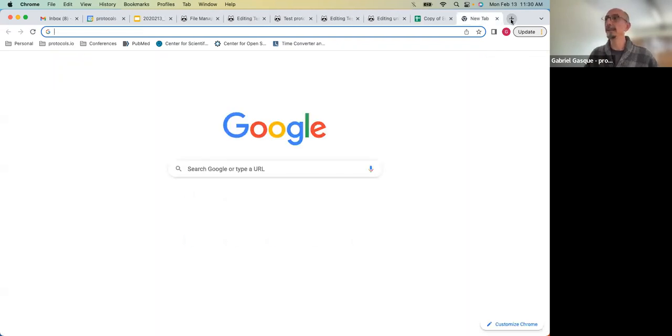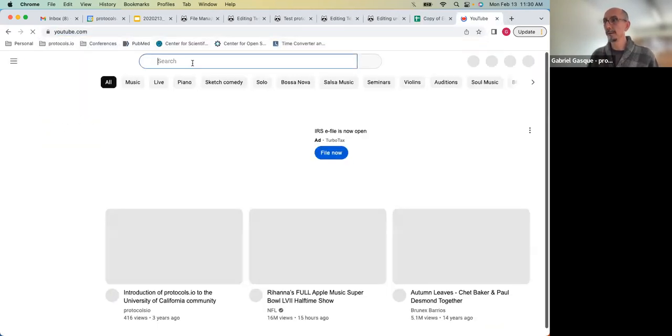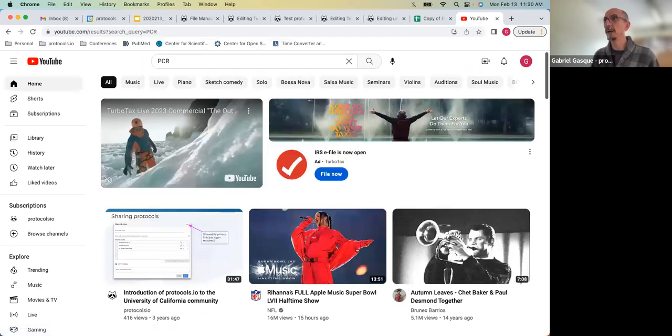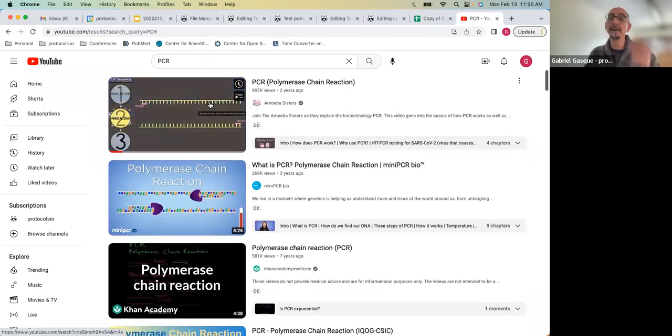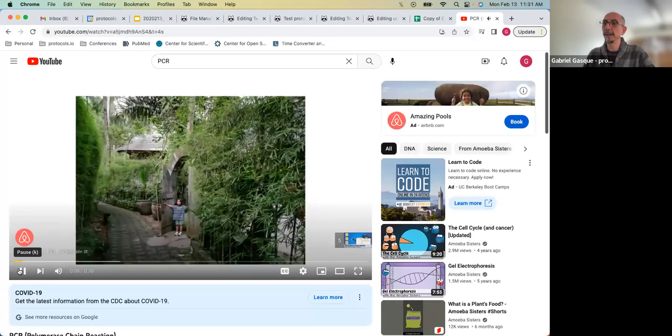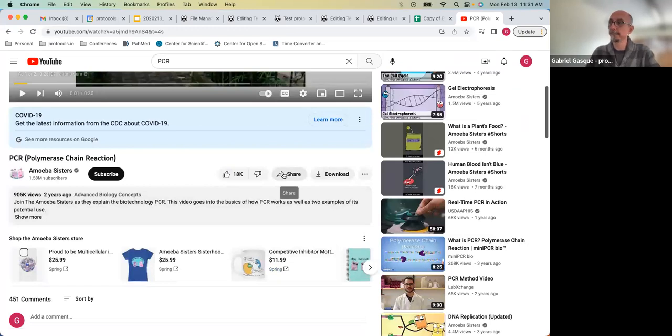So let's do that. YouTube, PCR. And let's say this is the video that I want to embed into my protocol. So I open the video. I go to Share.